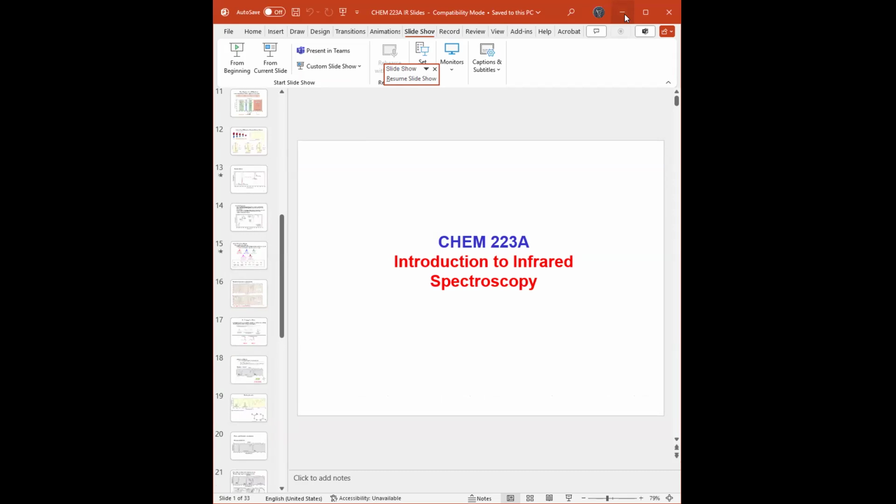So definitely I'm getting a lot of the same answers. You can see carboxylic acid. Yes, I have some questions like carboxylic acid question mark. Yes. Somebody said carboxylic acid at 1700. Not exactly. At 1700, you have the carbon oxygen double bond. That's a carbonyl. A carboxylic acid contains a carbonyl, but it is not solely a carbonyl. So make sure that you look at the whole spectra and then put the pieces together. You do have the beard that is characteristic.